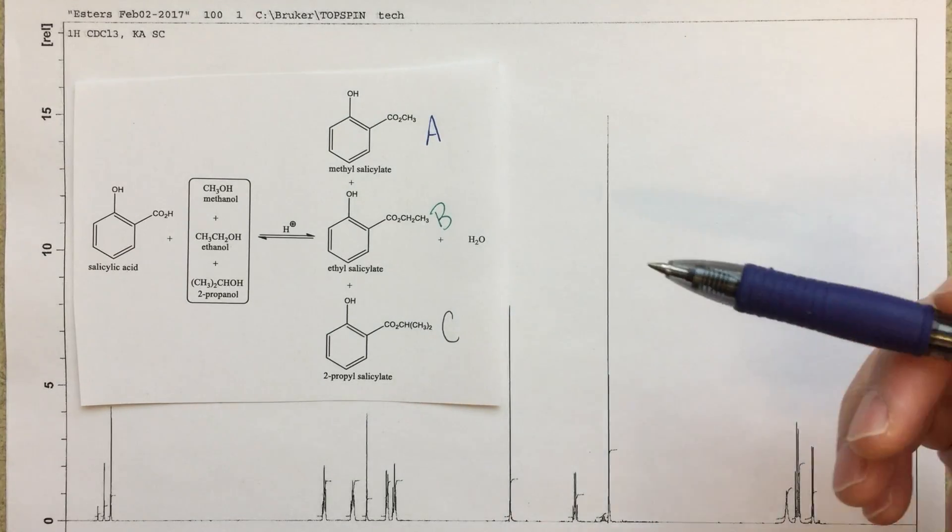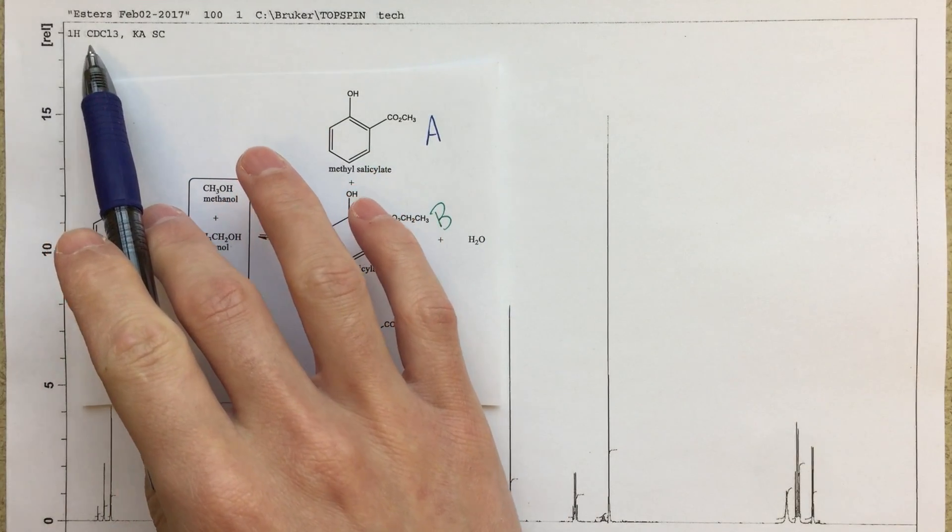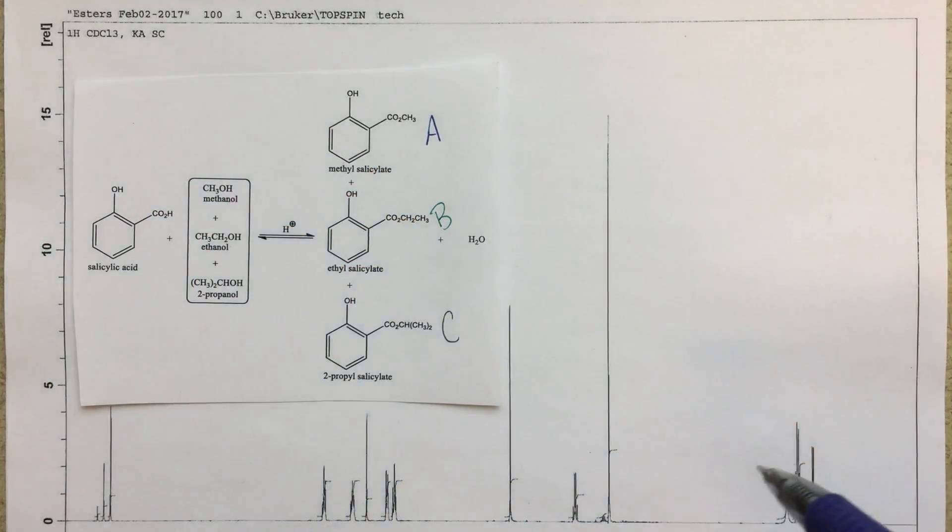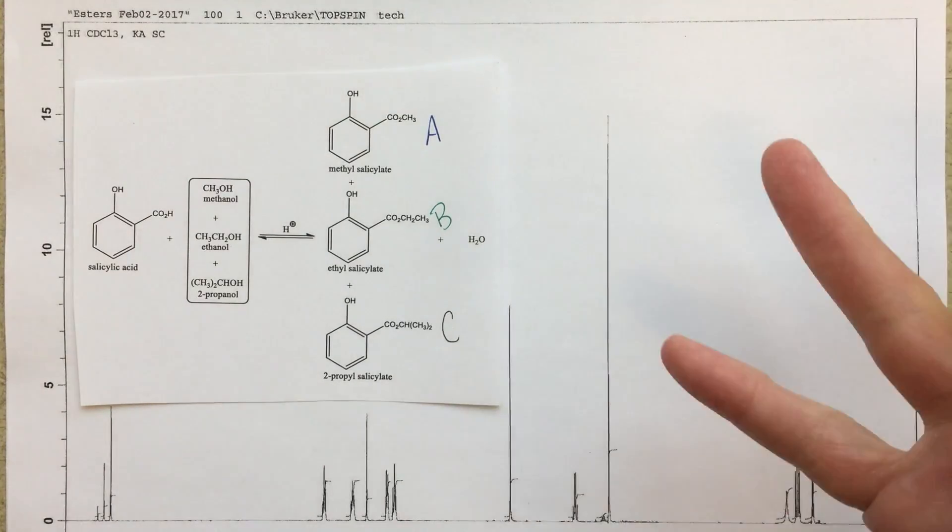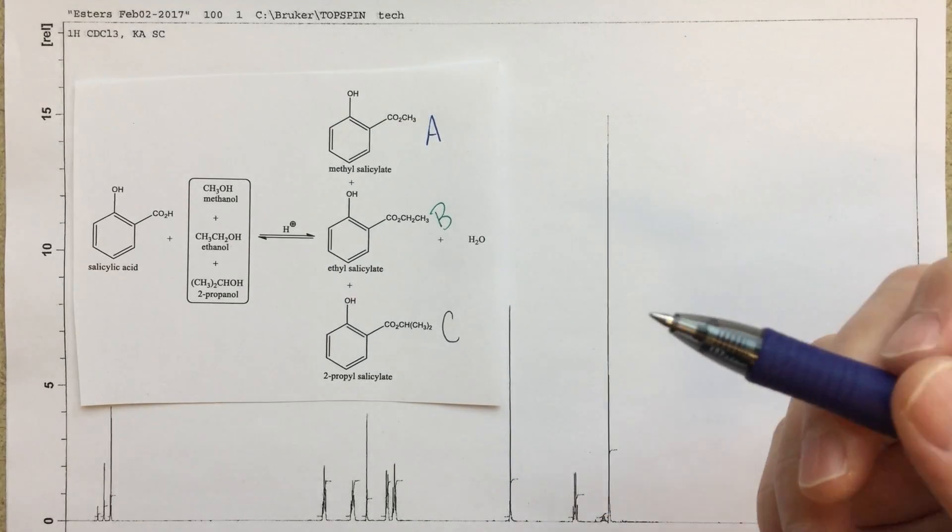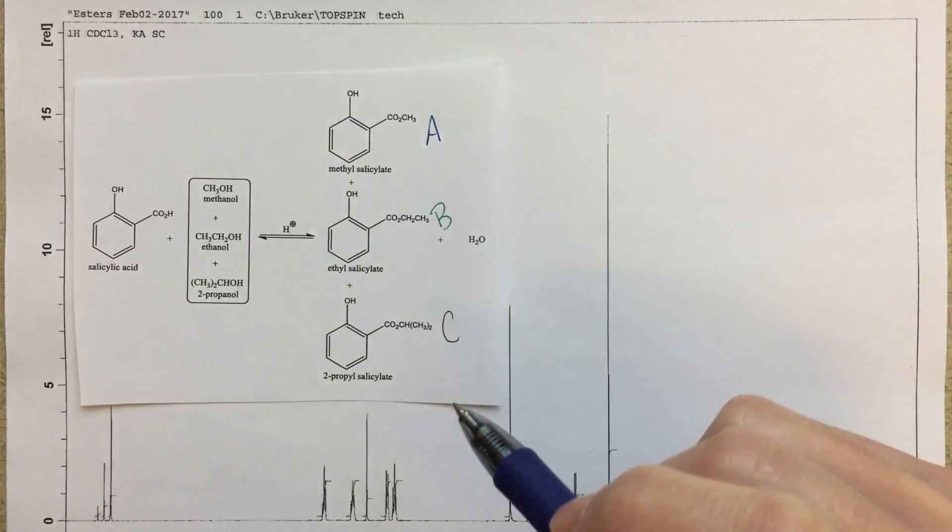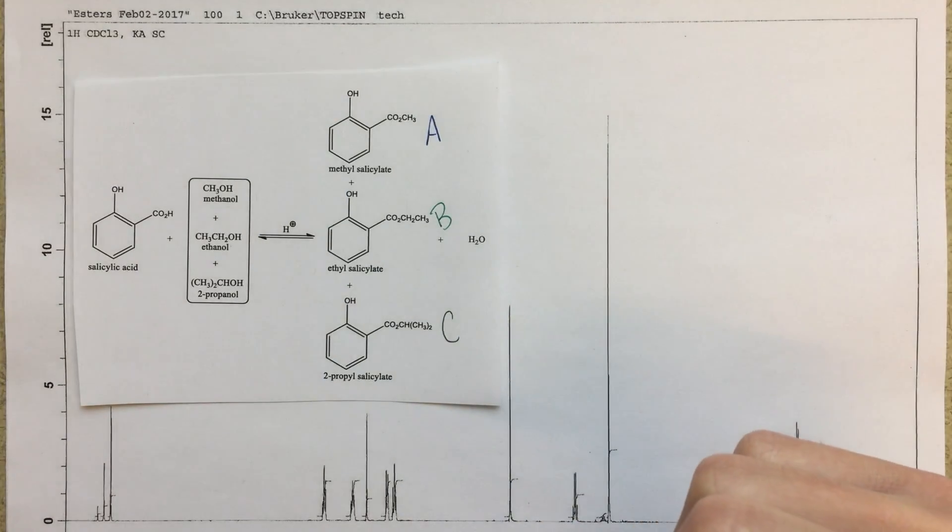The first thing I'm going to be looking at is what the NMR solvent is. Right up here it tells us that this is a proton NMR and the solvent is CDCl3. Now CDCl3 should not show up on the proton NMR because it's deuterium, but there is going to be a residual solvent peak. Some of that CDCl3 that you use is actually going to be chloroform, CHCl3.